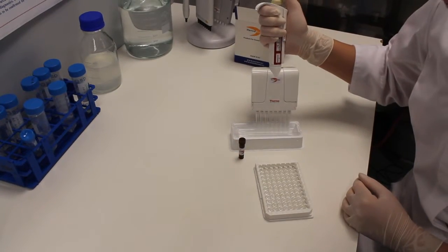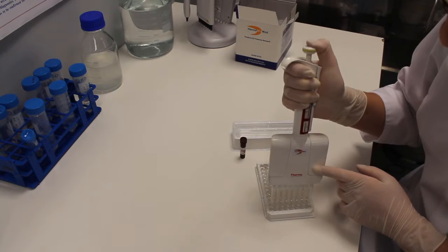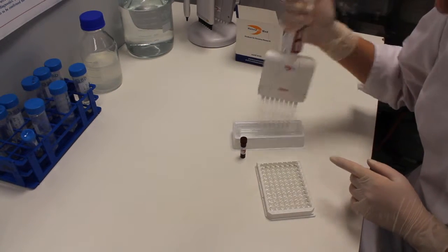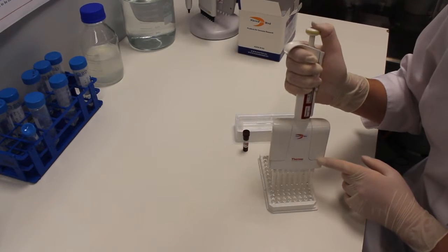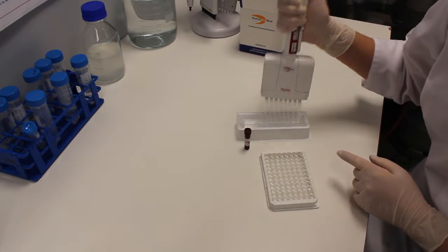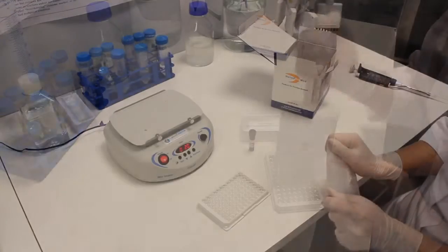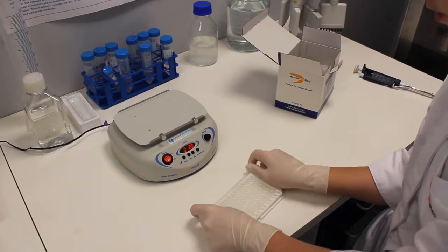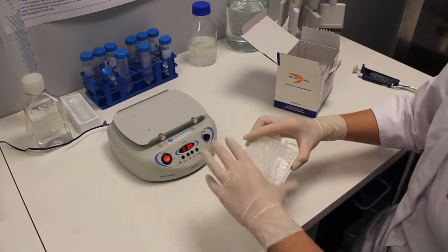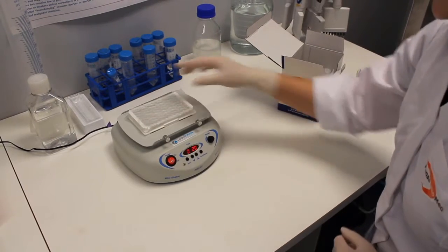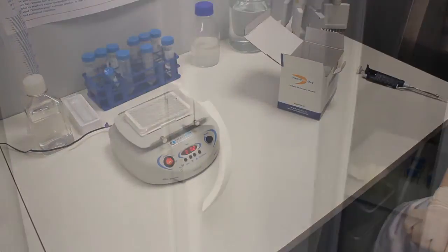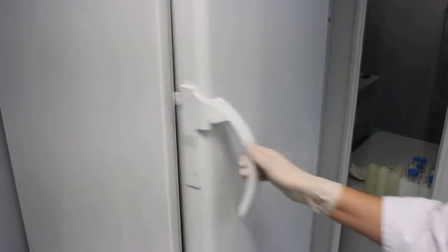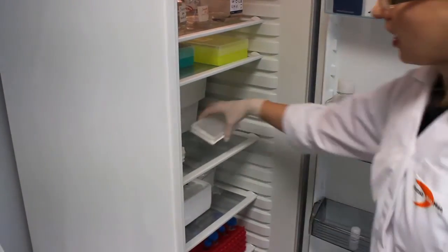Add 100 microliters of diluted secondary antibodies into each well and incubate at room temperature while shaking for 20 minutes. Then incubate at plus 4 degrees for 1 hour.